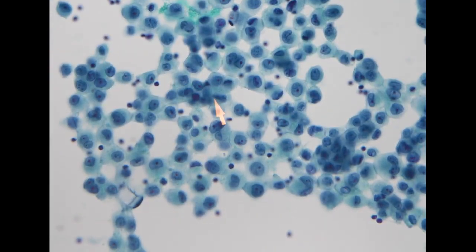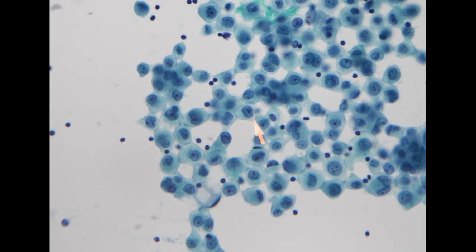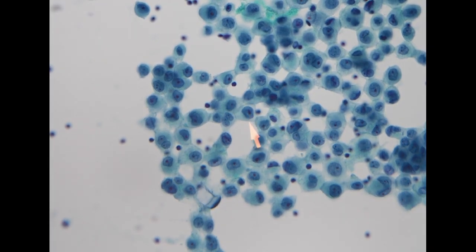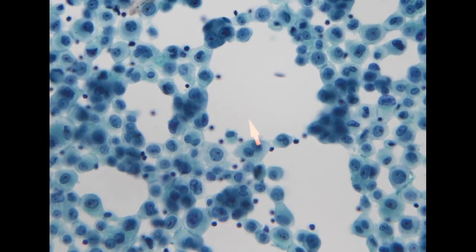And finally, I would say the nuclear atypia of these mesothelial cells is more prominent than in a reactive process. It is very easy to see nucleoli in the cells, with a very bizarre shape. For example, this one is a cherry red nucleolus with an elongated shape, which is also uncommon for a reactive type process.